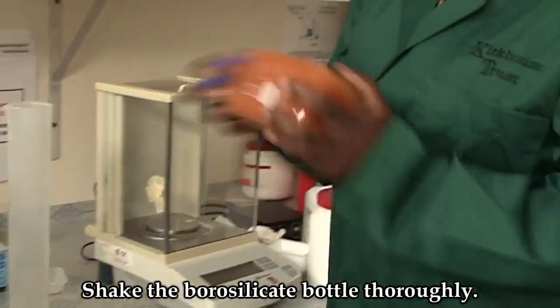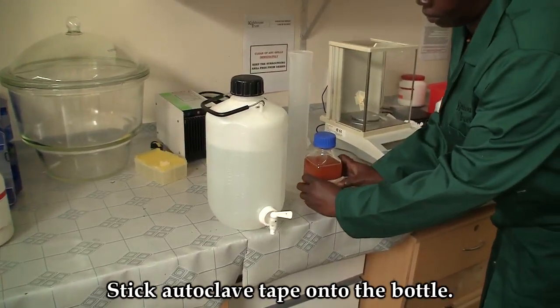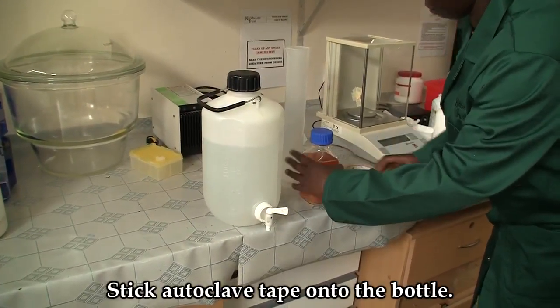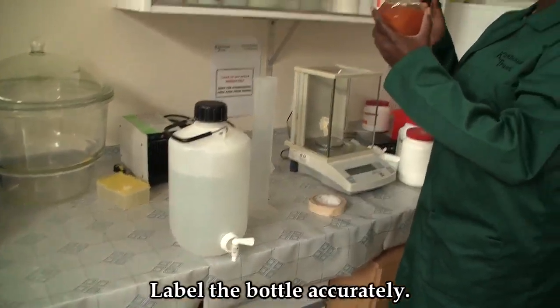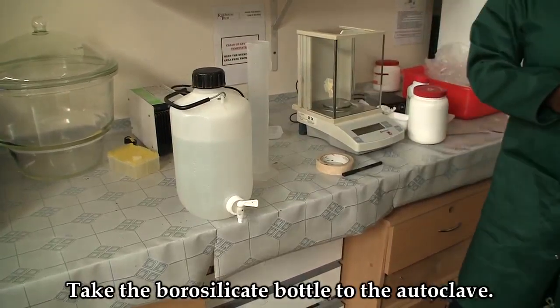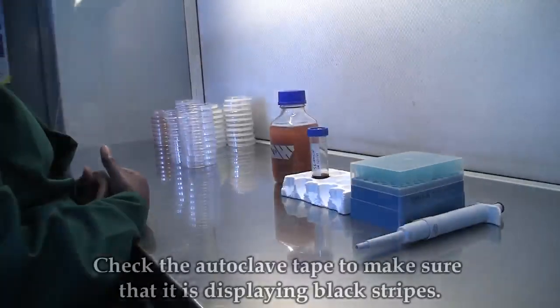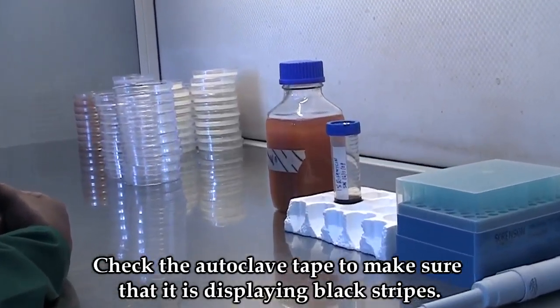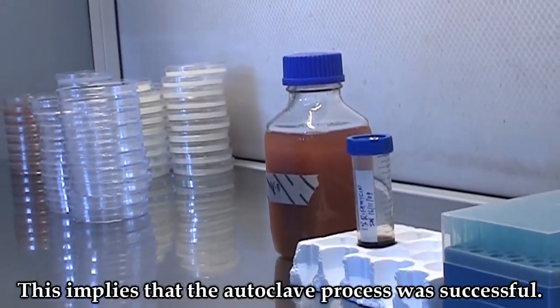Check the bottle very well. Stick autoclave tape onto the bottle and label it well. Take the bottle to the autoclave. Check the autoclave tape to ensure it has black strips, implying that the autoclave process was successful.